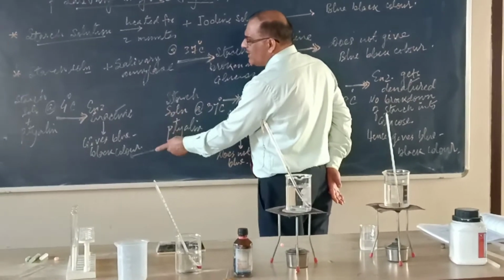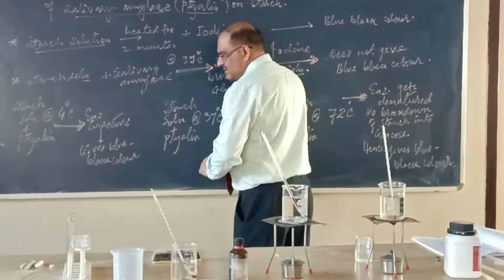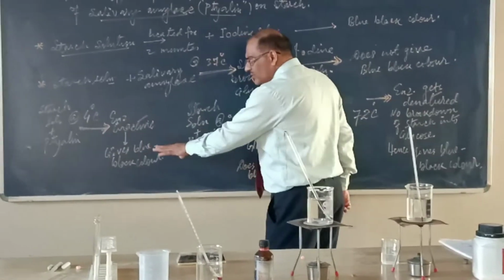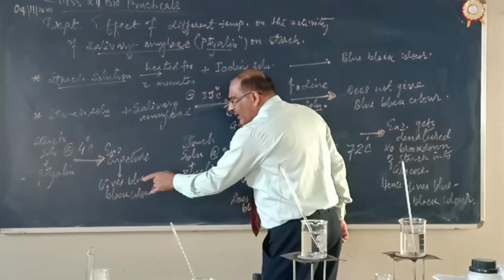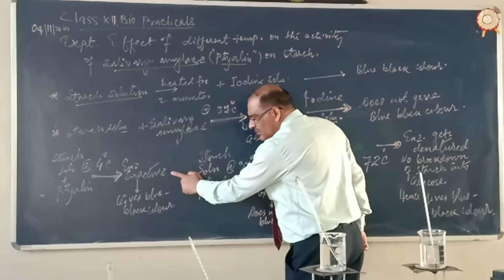Starch को glucose में break down नहीं करता है. Okay, so that's why starch is there. Starch is not broken into glucose, so starch is there. So when we put iodine solution in it, what happens?